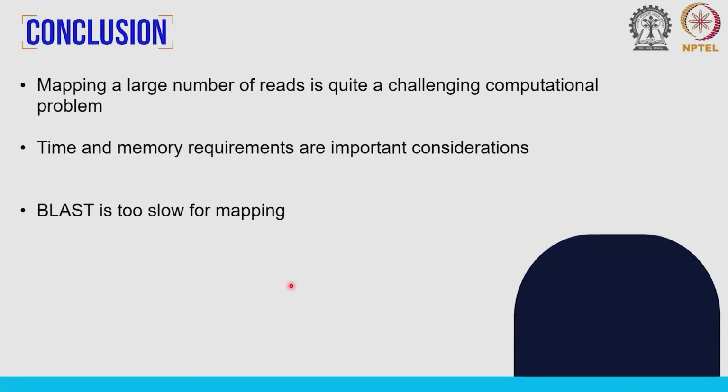This is again very important, because if you can run this analysis on your desktop system, that will be great, but if it takes a lot of memory and you need sophisticated servers and large computational resources, that will again limit the accessibility. So these are two important considerations. What we have also seen is that BLAST is too slow. We cannot of course use the brute force approach at all, that will probably take forever. But even BLAST, which people used for searching through databases, is too slow for mapping when you have a large number of reads, approaching billions.